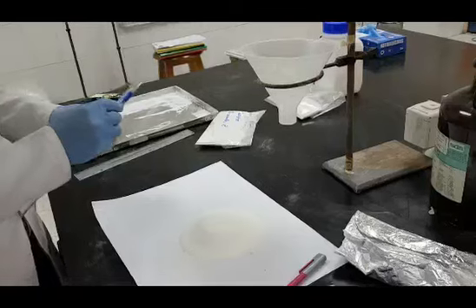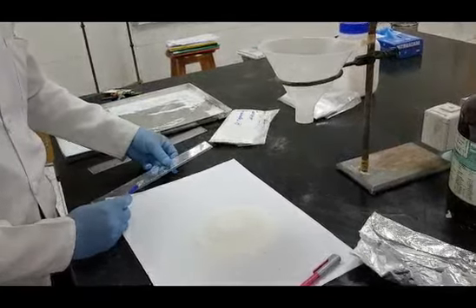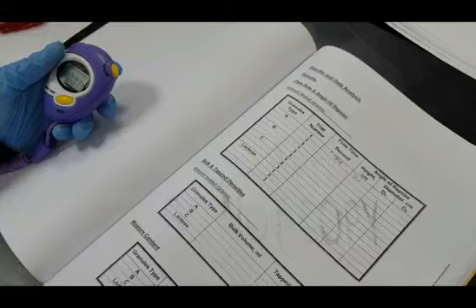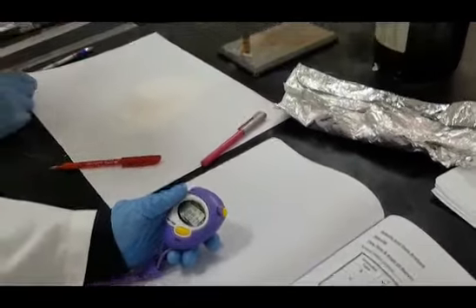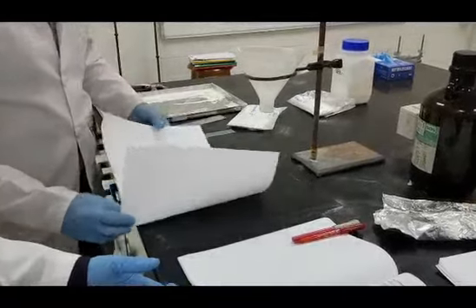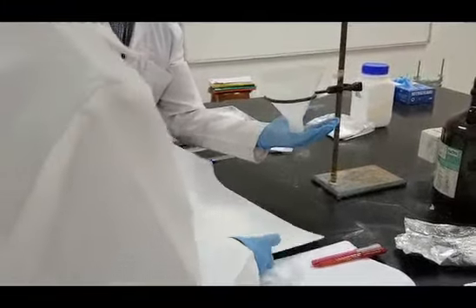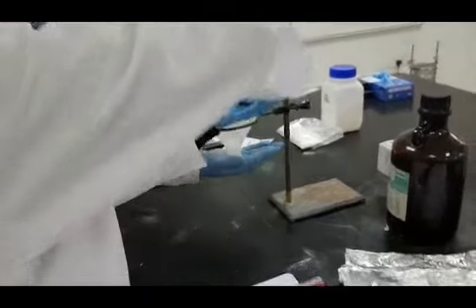Remember, the one who's holding the funnel should maintain holding it with his left hand all the time during flow. If you are left-handed, please hold the funnel with your right hand and close the small opening of the funnel with your left hand.